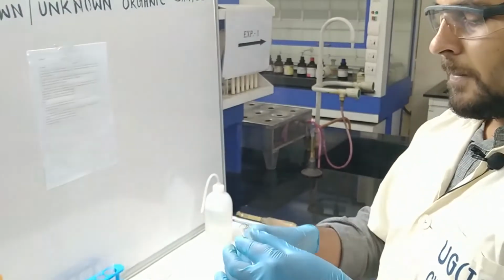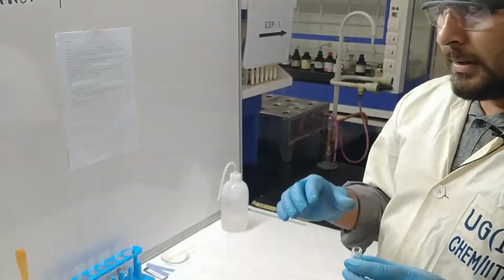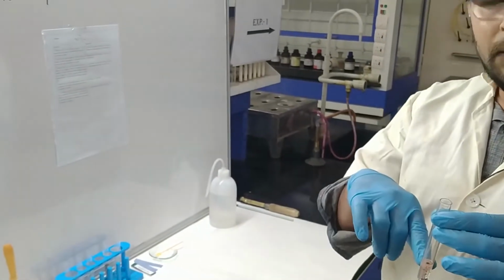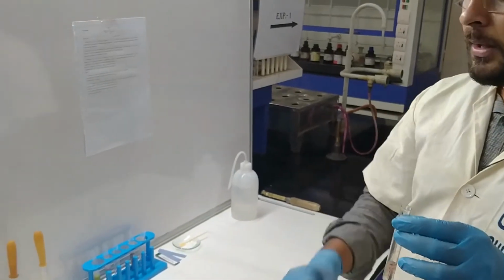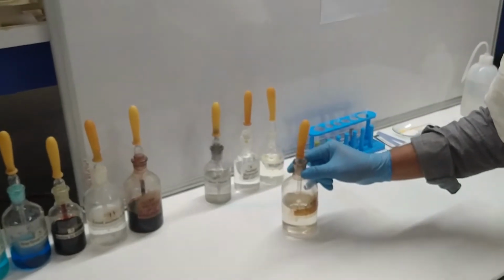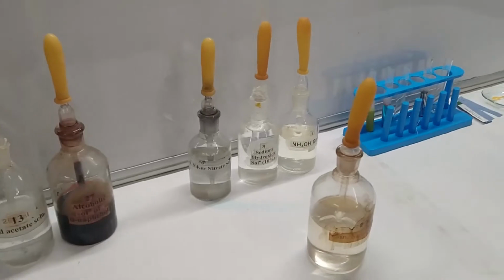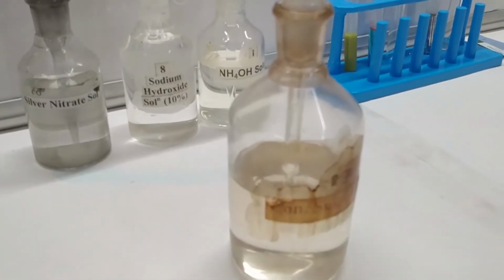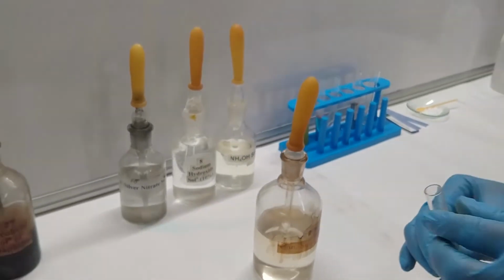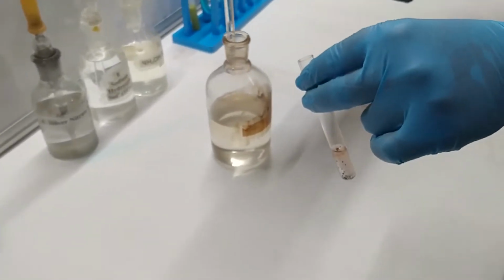Now what do we have to do after this? We have to add some drops of concentrated H2SO4 into this mixture. Okay, so this is the concentrated H2SO4, and whenever you deal with concentrated H2SO4, guys, you have to take extra care. So in an inclined fashion, I'm going to add this one over here.